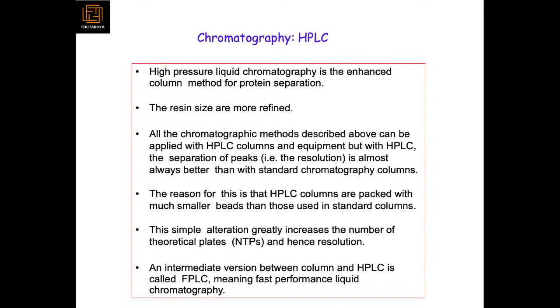Okay, so now comes one of the most important and most highly used chromatography methods, HPLC, that is high performance liquid chromatography. Basically, we apply high pressure inside a column, a C18 column, and put our sample into it. The components get separated because of that pressure and give various peaks in the data collector, so we can differentiate which proteins were present in a mixture, and we also get those proteins separated.